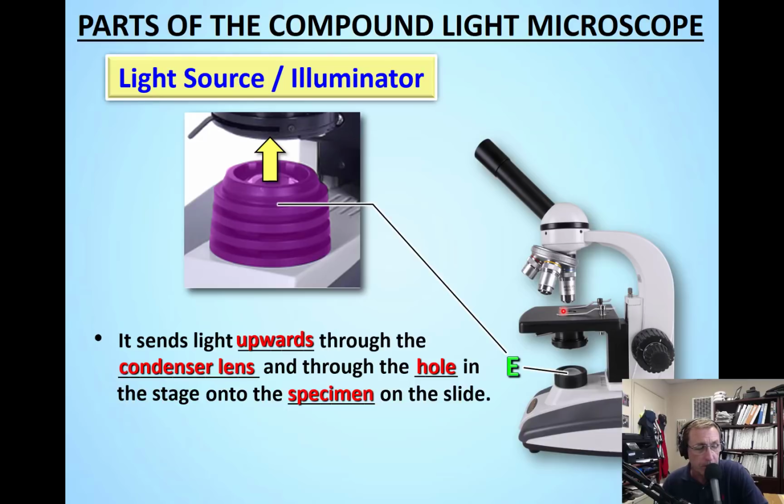And there'll be a specimen on a slide. The slide's the glass part. The specimen is what's on the slide.